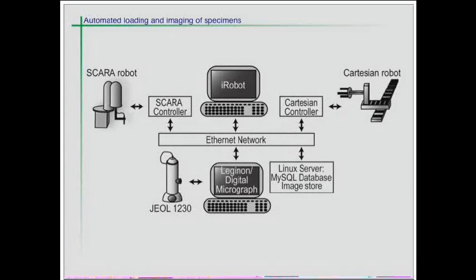So Leginon now will control these 2 robots, will control the automated imaging, and will also send all the images to a database, to a laboratory inventory management system, which I will show you a bit later.